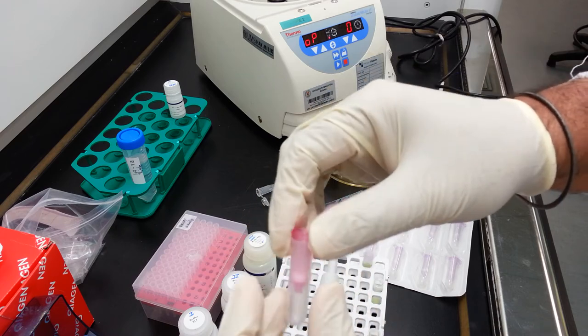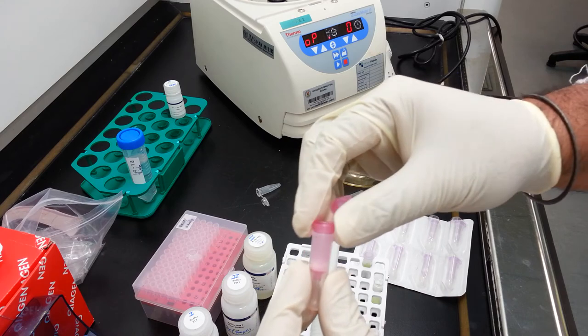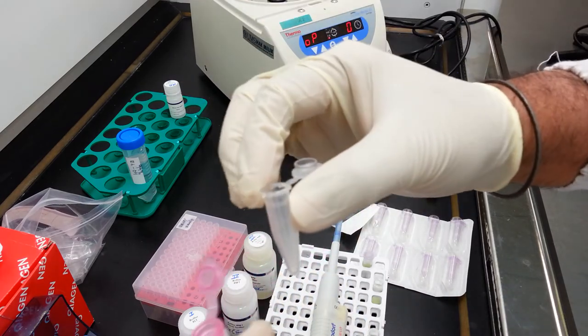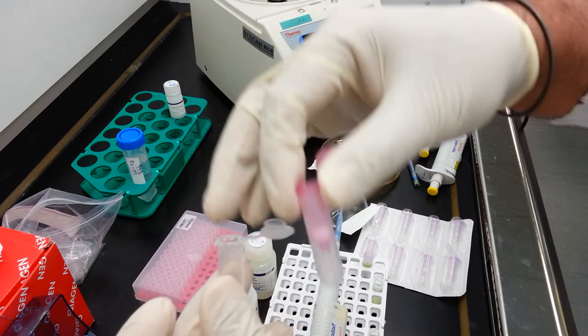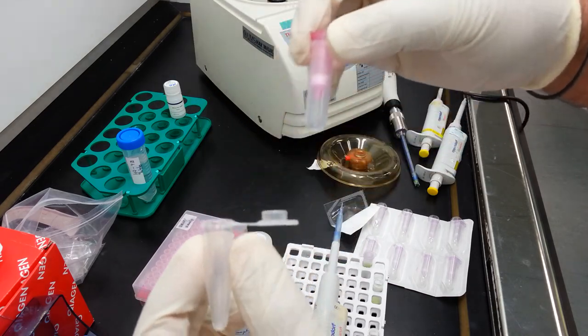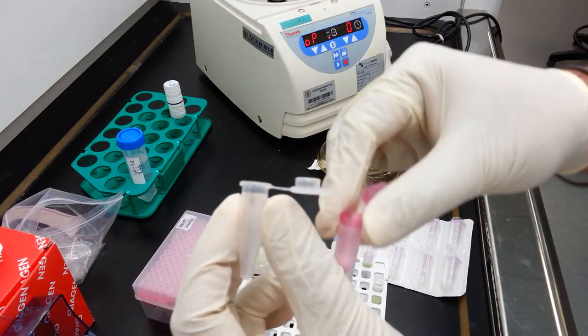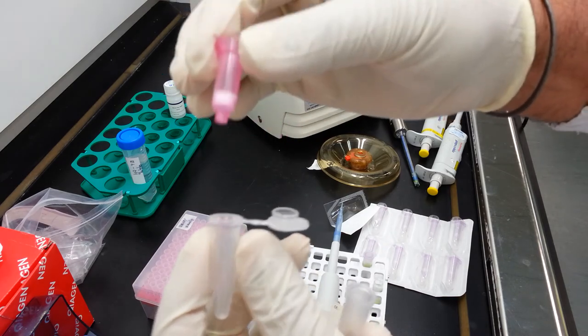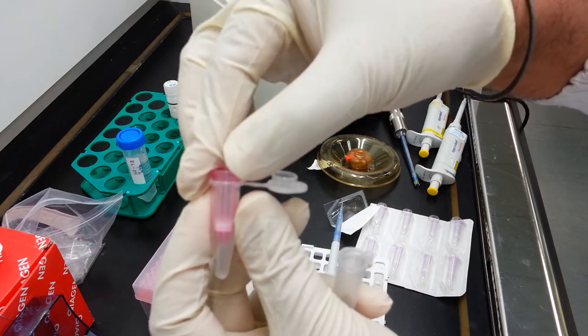The next step involves recovery of the RNA. In order to do this, use a fresh sterile centrifuge tube. In this case, it's a 1.5 ml eppendorf tube. Transfer the pink column into this tube.